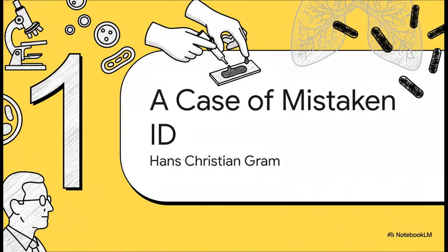Well, that brings us to our main character, a Danish physician named Hans Christian Gram. And here's the thing. Back in 1884, he wasn't even trying to solve that huge problem. Nope, his goal was way more specific. He was just trying to figure out a way to make bacteria stand out from the lung tissue of patients who had died from pneumonia.